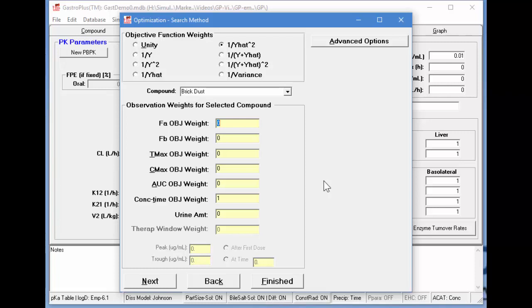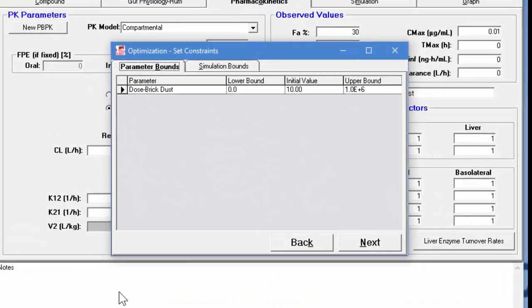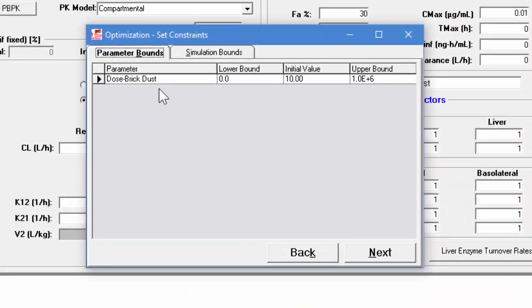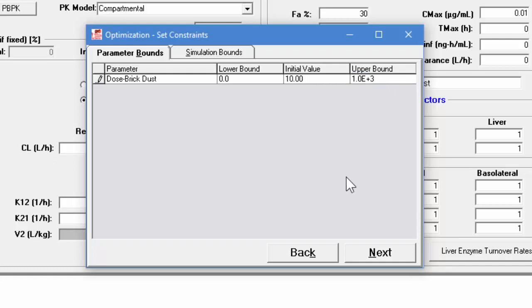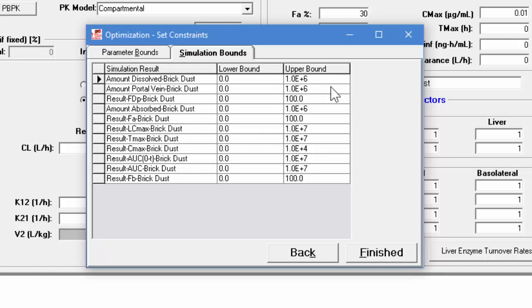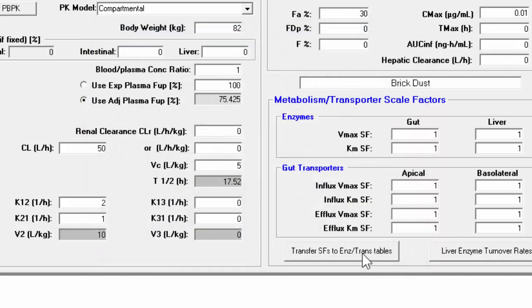This next dialog box is for the optimization. We'll use the function 1/ŷ² and set the objective weight function for Cmax to 1, setting all other values to 0. Proceeding to next, this specifies the bounds for the initial dose. The initial value is 10, the lower bound is 0, and the upper bound is 1 × 10⁶. We'll set the upper bound down to 10³ so we won't get a dose over 1 gram, then click next. I'll leave the initial simulation bounds unchanged and click finish to set up the optimization.